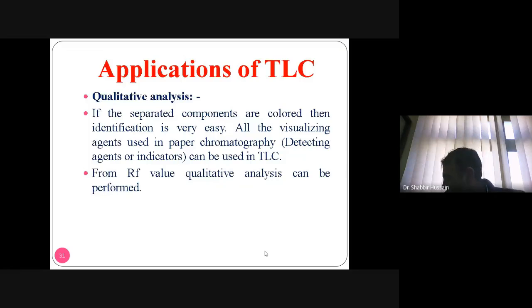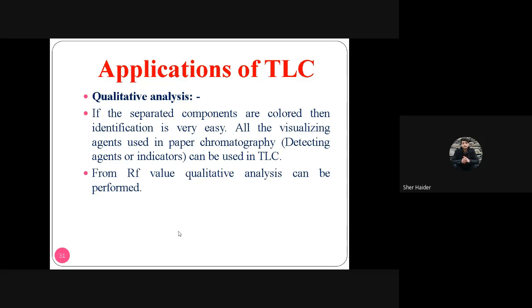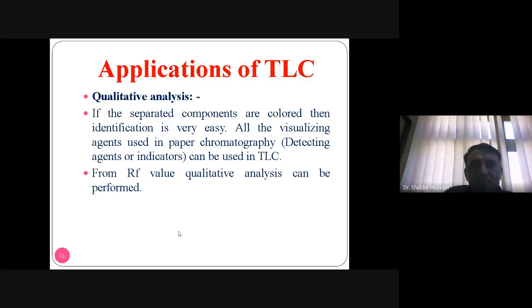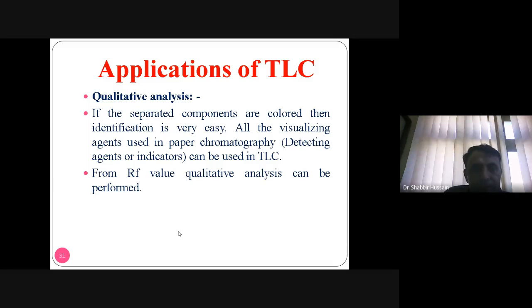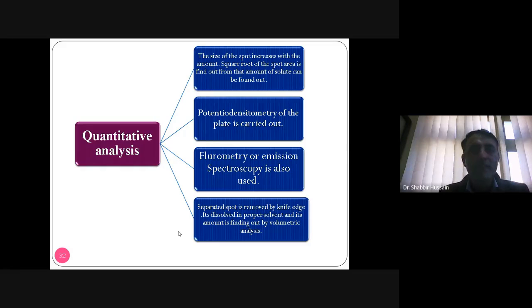Application of TLC. Any question till here? No, sir. Okay. Application of thin layer chromatography. One is qualitative analysis and another is quantitative analysis. As I have already told you, what do you mean by qualitative analysis? In simple way, we can say that qualitative means what it actually is, and quantitative analysis means how much it is, right? How much it is, that is called quantitative analysis.